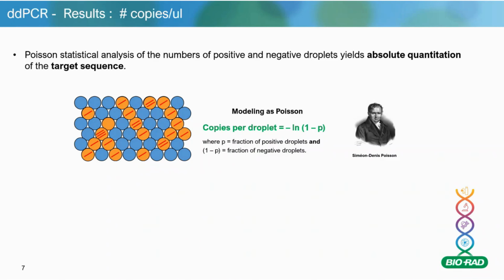So the way I describe this to customers, generally, I'm sitting in an event, a seminar type setup, and there's various tables. Maybe there's 10 tables. And at each table there's 2 people, or there's 3, 2, 3, 4, a mix of people. But if I count those 10 tables and I average them out, I can get an idea of how many people are sitting at each table.